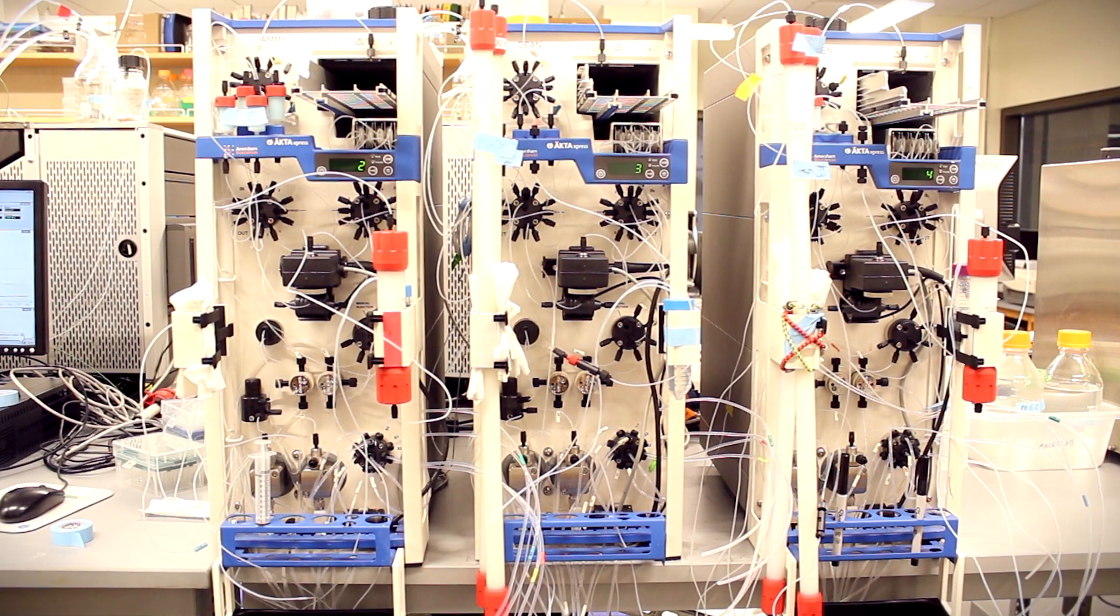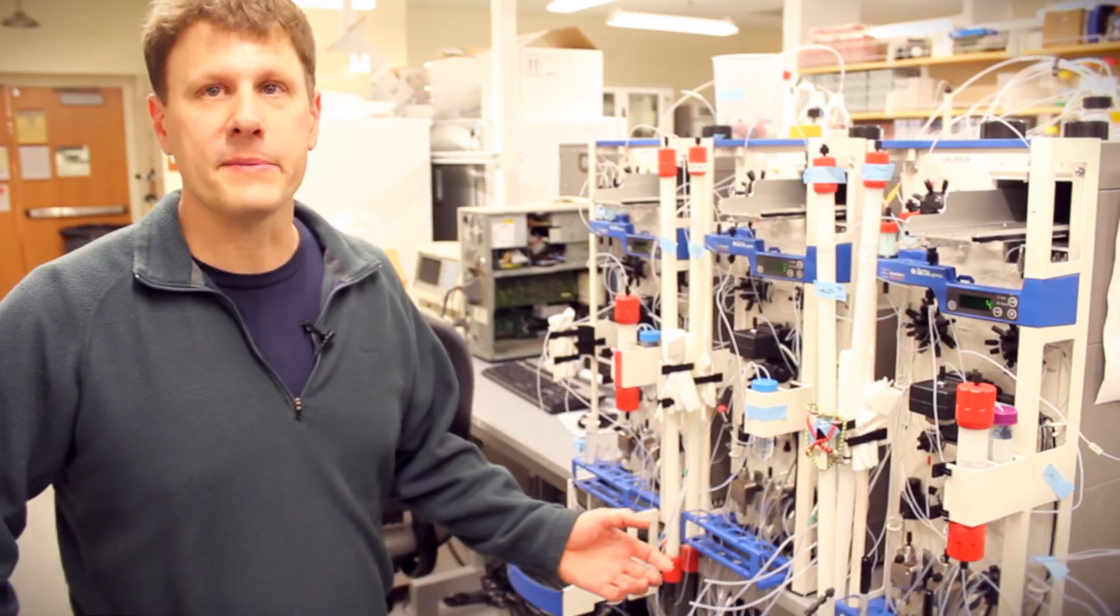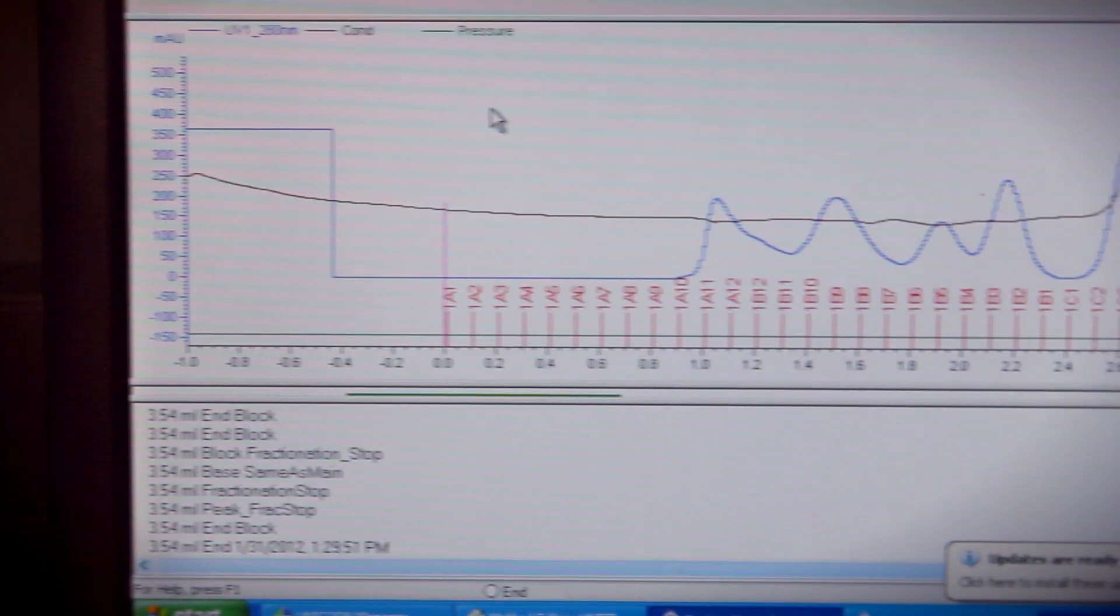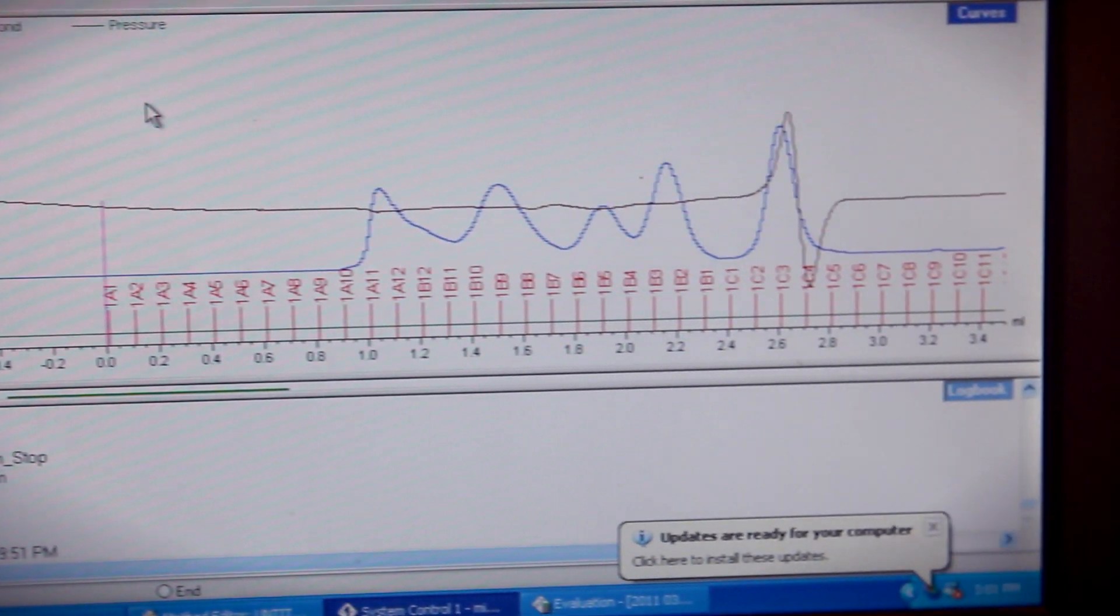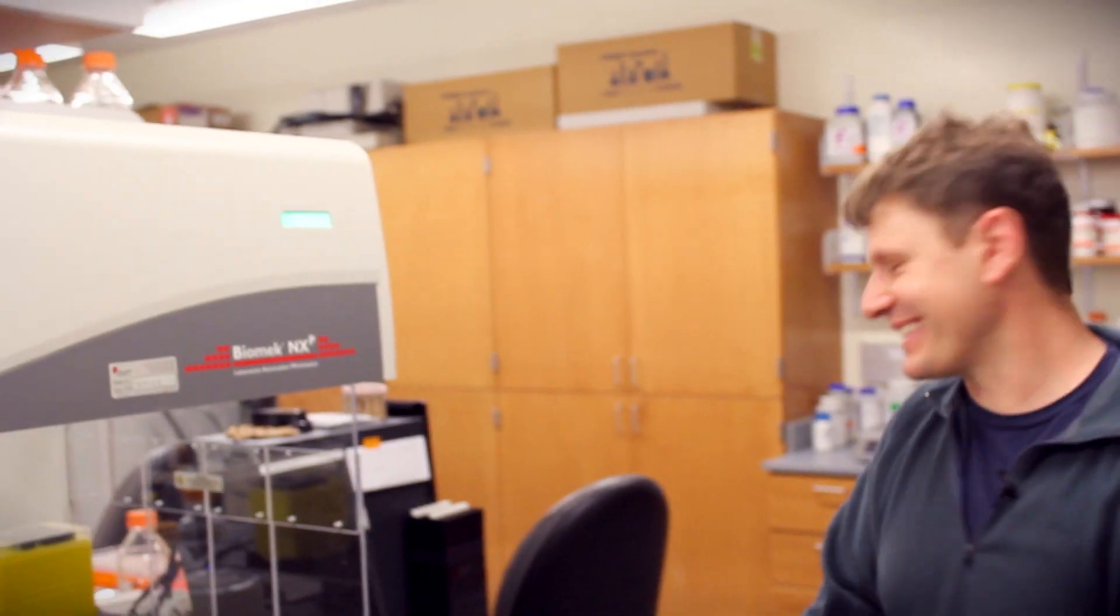These are high throughput FPLCs. It's able to put your protein over several columns. So that's kind of how we can do large-scale protein purification. We do have robots to take away the monkey work. That's nice.